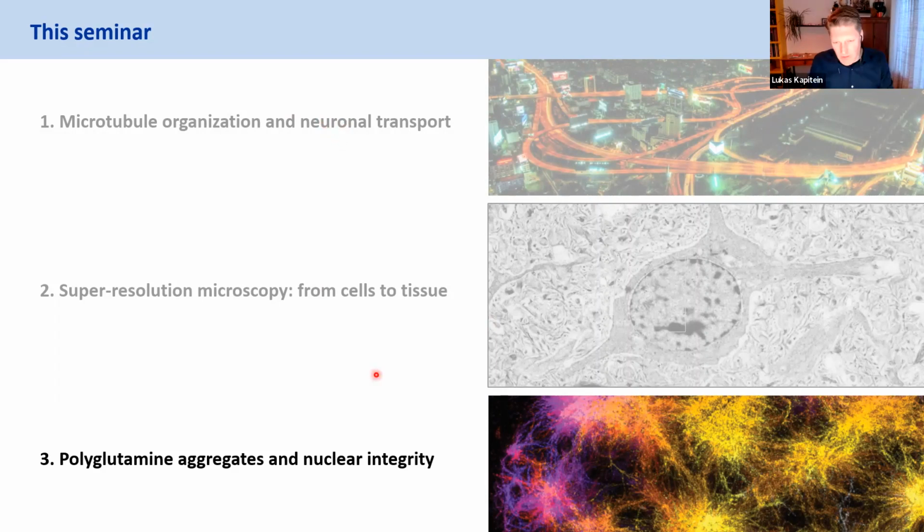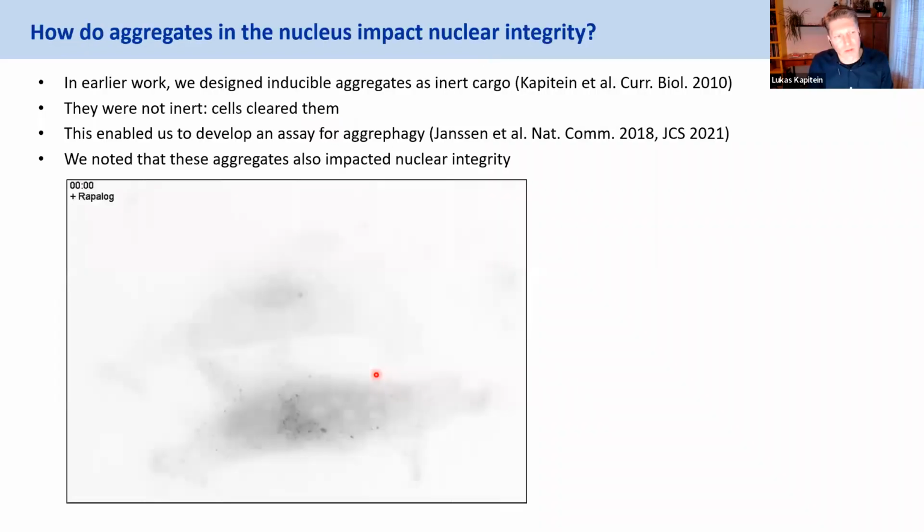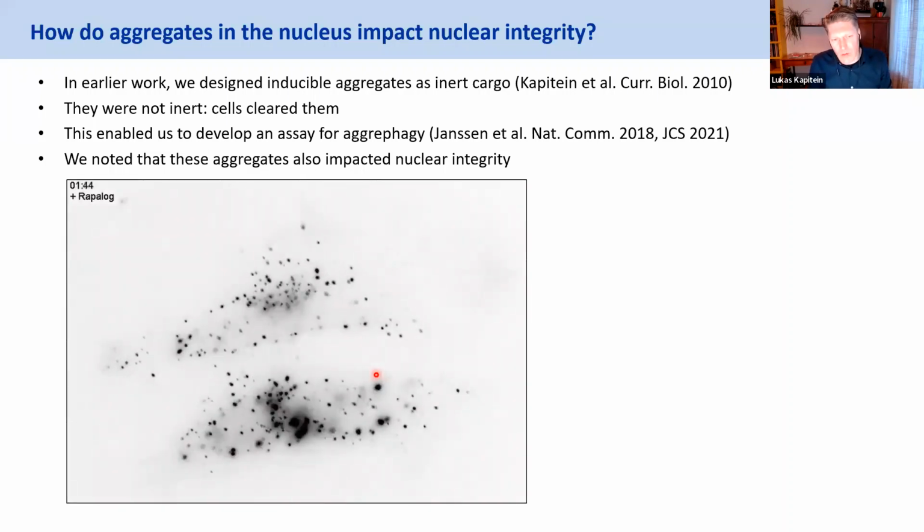Now, in the final few minutes of my talk, I will give you a small glimpse of what we are doing in terms of studying aggregates. I need to introduce this a little bit. How did we get into studying aggregates? At some point, for our inducible transport assays, we didn't want to use peroxisomes anymore, but wanted a much more orthogonal cargo. So we started to play with making protein clusters inside the cell that would then serve as cargos for motors.